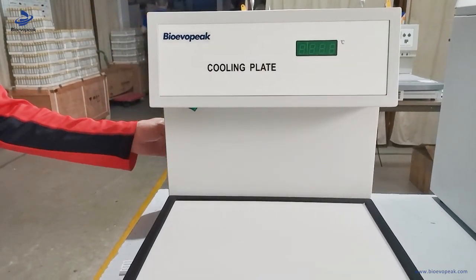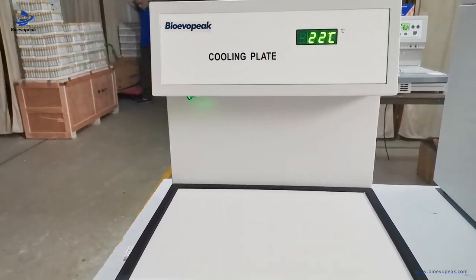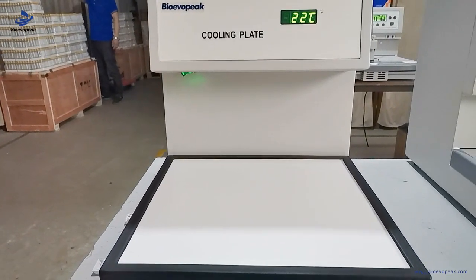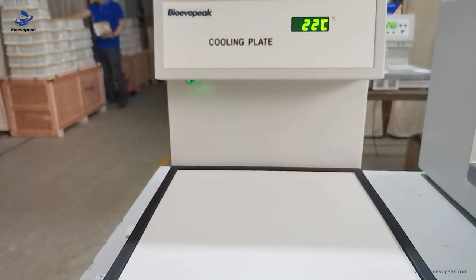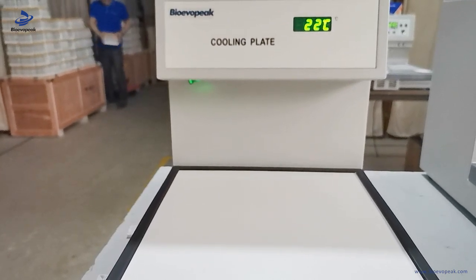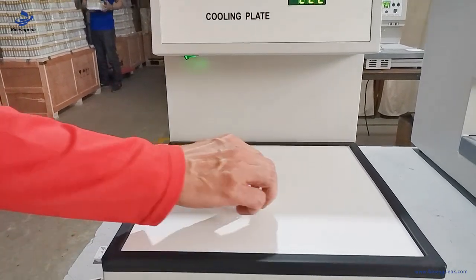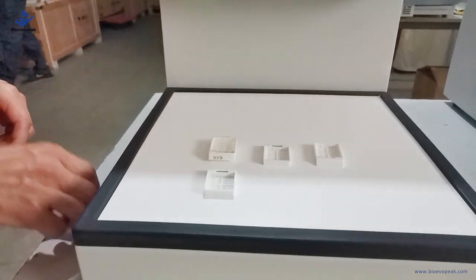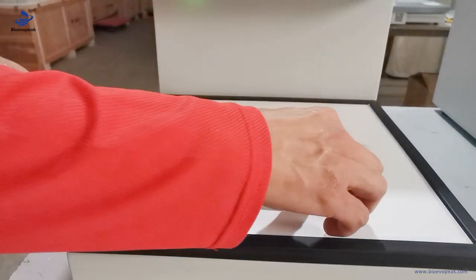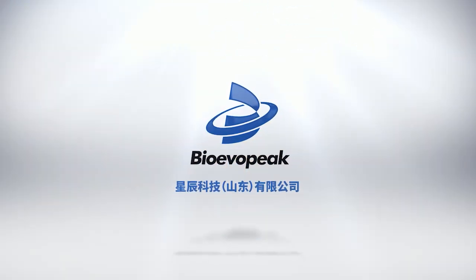Dear users, this machine is the cooling plate. Firstly turn on the power, then turn on the switch. The machine will begin cooling itself. When the temperature goes down to around minus 15 or minus 20 degrees, we can place the cassette on the table.